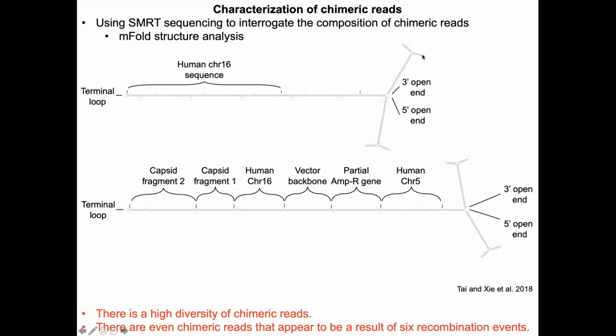In addition, as I had mentioned before, ITRs are important for the conversion of the linear forms of genomes to the circular episomal sequences.